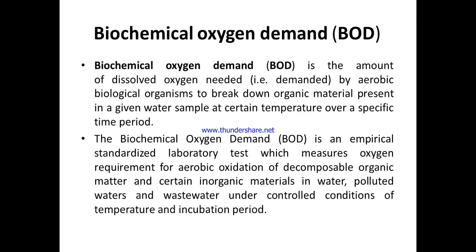Why? Because there are microorganisms, aerobic bacteria, present in the water sample, and they consume the dissolved oxygen for oxidizing the organic matter that is present in the water. And more specifically in wastewater, a high quantity of organic matter is present.